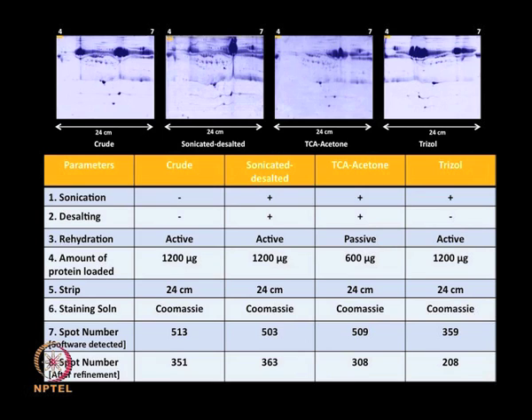So, I am trying to give you all the details of what one needs to actually perform before reaching the stage where you can compare the healthy controls with the clinical samples. This lecture is trying to cover various concepts which we have talked about in sample processing and in different lectures of two-dimensional electrophoresis.